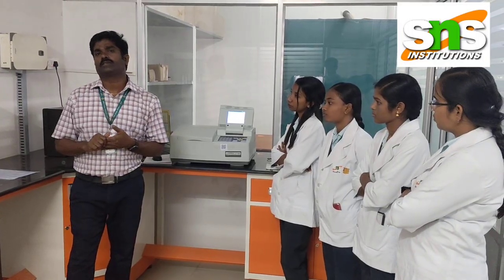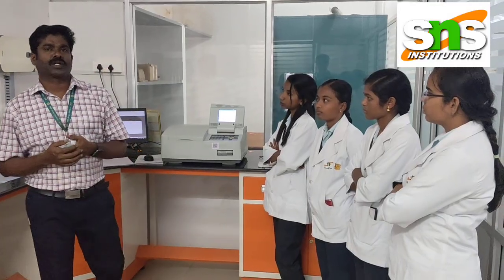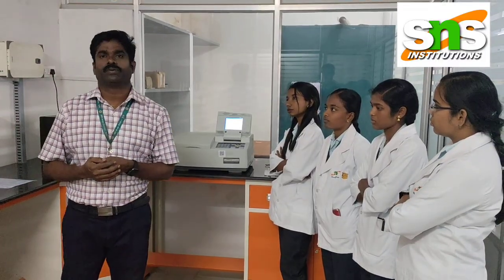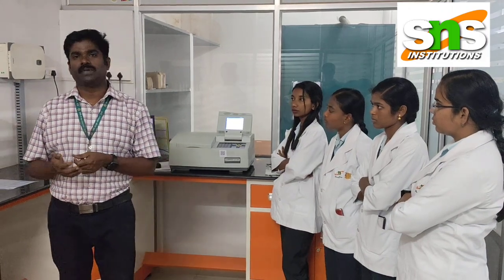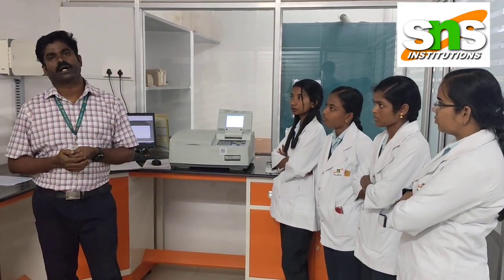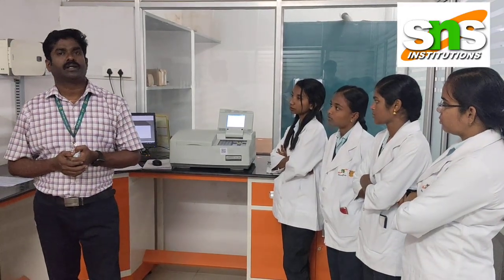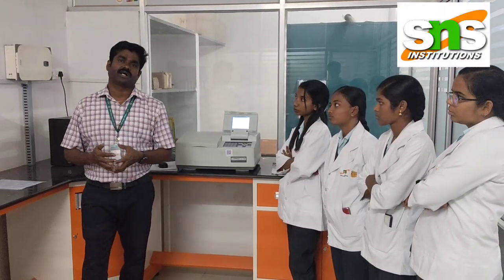quality control activities. Why is there such importance for QC activities? We need to fulfill and obey the major guidelines, whether ICH guidelines, the International Conference on Harmonization, or WHO guidelines. We need to follow such guidelines, and we need to implement GLP and GMP in the QC activities also.